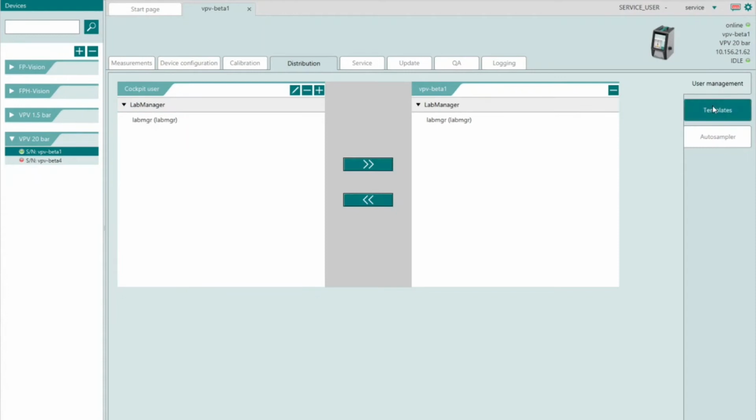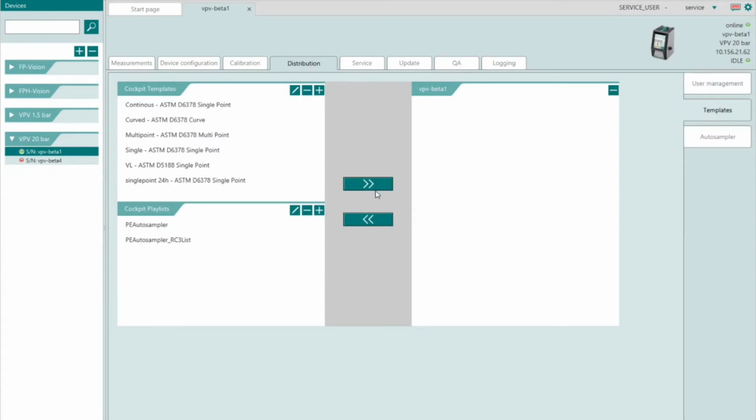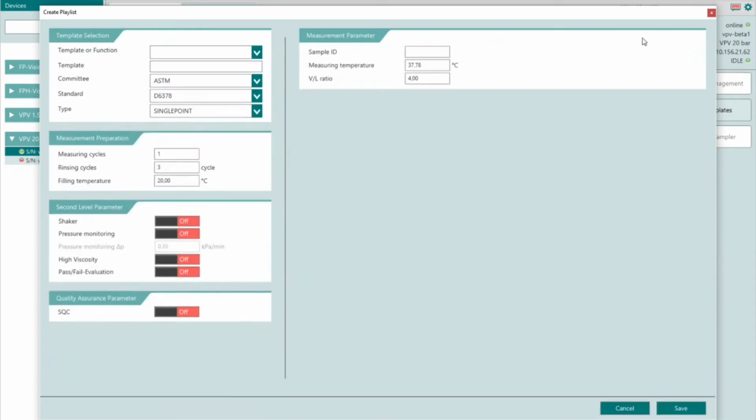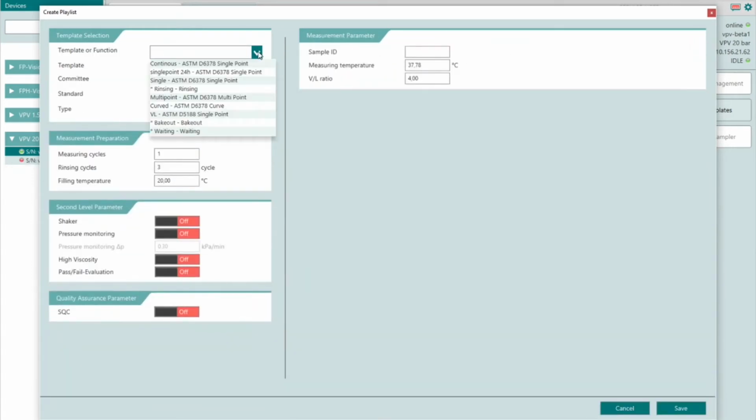Then select the template subpage and let's create a new playlist by hitting the plus icon. Use the default name or choose your own playlist name, indicating the sample set. Choose the corresponding autosampler, in our case the Perkin Elmer S10. Now hit the plus icon on the playlist generator on the right.